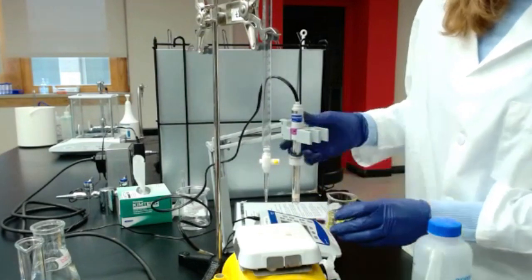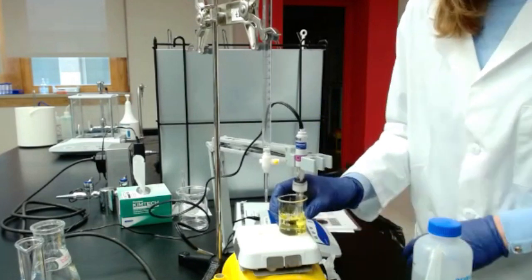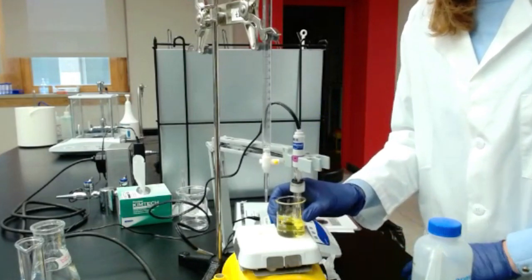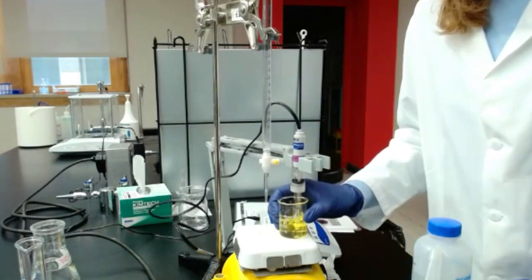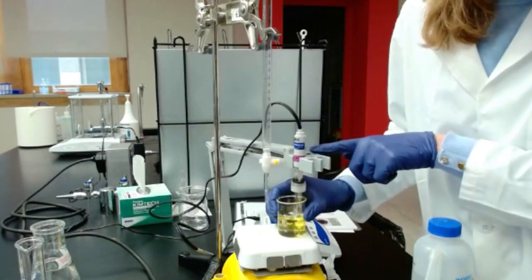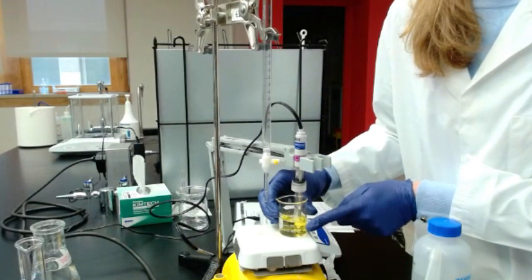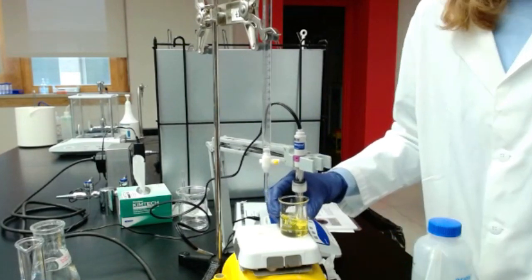So I'm done with pH 4.01, so I'm switching to pH 7.0. And it's going to stabilize or calibrate again. So I keep stirring. I keep making sure the probe is within the solution.